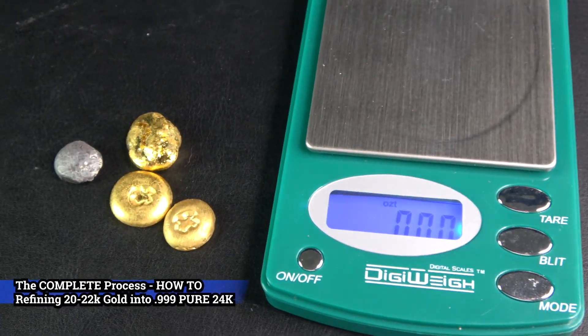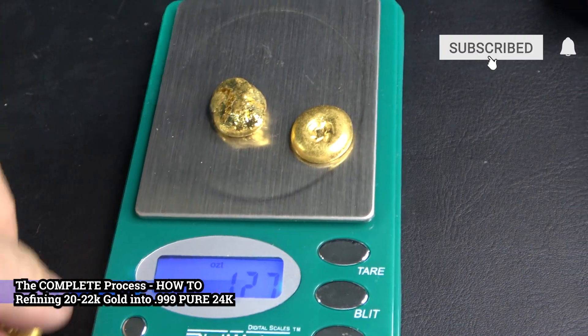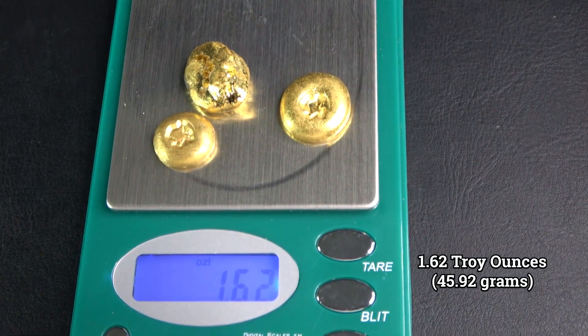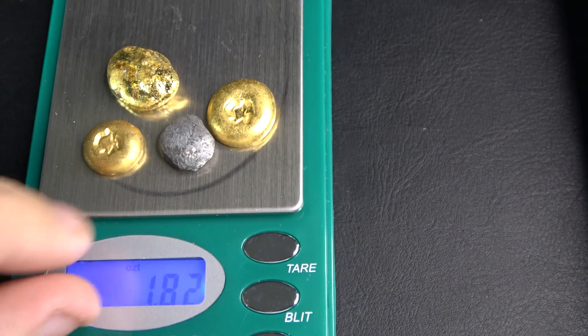Welcome back guys. Today we are going to take a few pieces of gold that have been once refined in some of my other videos and turn it into pure 24 karat gold and check it with our Sigma. I have three pieces here totaling 1.62 troy ounces.